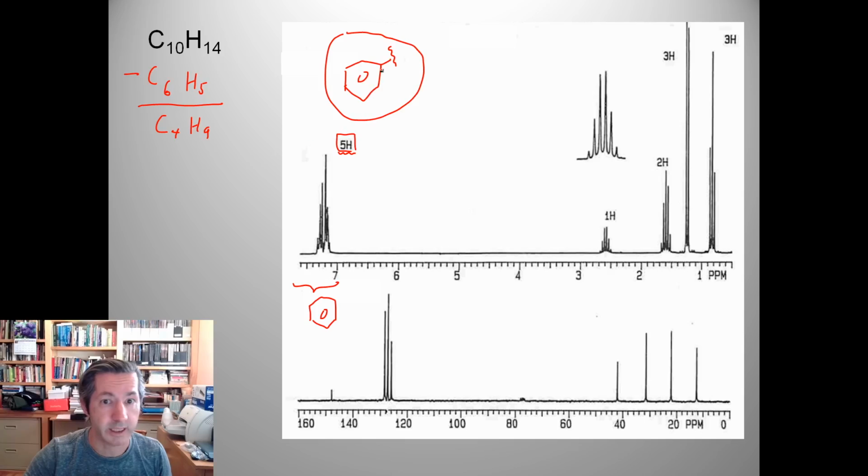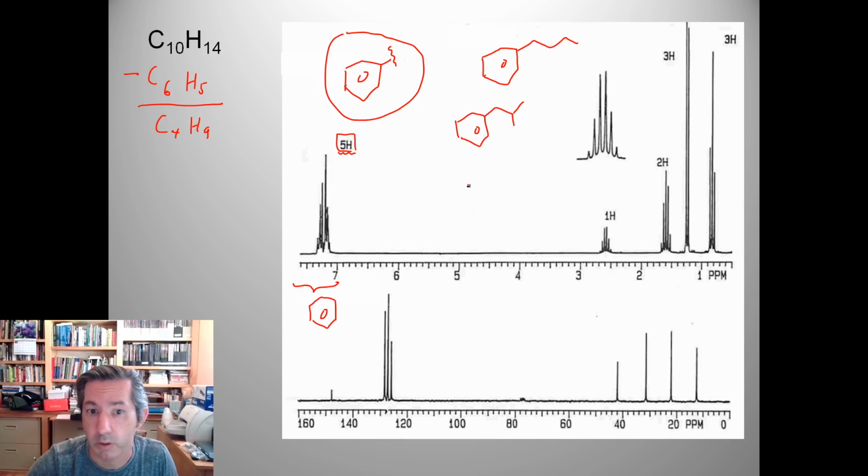So that only leaves 4 other carbons to deal with on this group here. And we have different choices here. When you get down to just a few possibilities, don't be afraid to take out a piece of scratch paper and draw those possibilities. There's only so many things you can do with 4 carbons. And let's do those things. So I can draw a butyl group if I wanted. I could draw the isopropyl or isobutyl group. Let's see, the sec-butyl group or the t-butyl group.